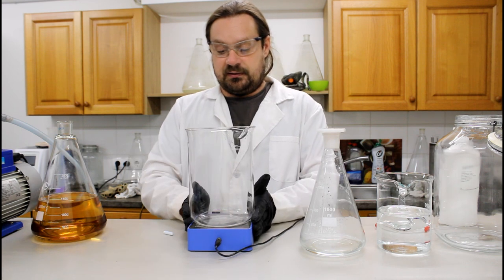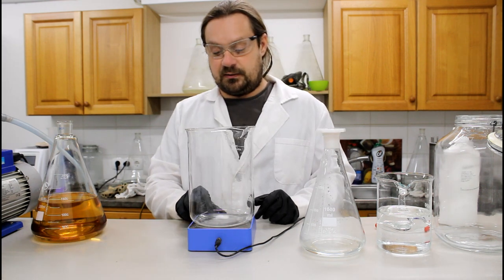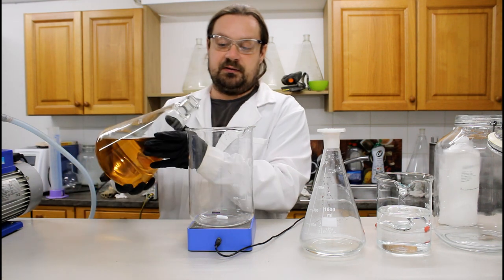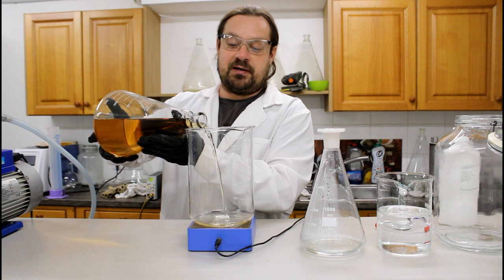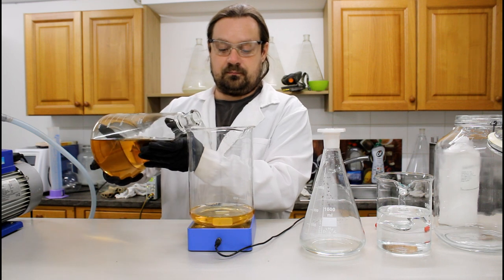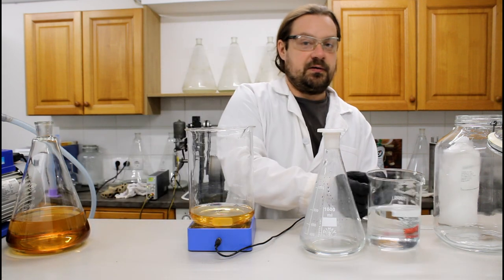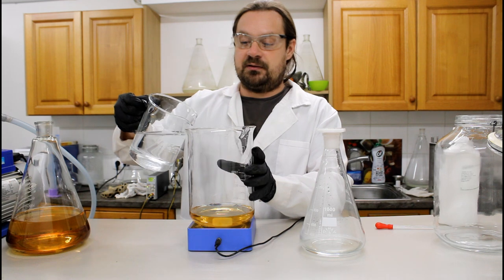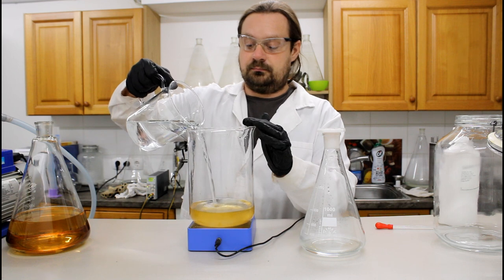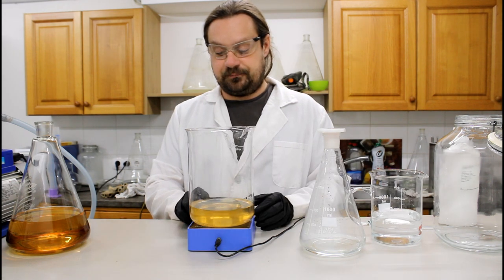So here we will do the precipitation. I just add a stirring bar. Okay, it works. So now we are adding a little bit of our high pH solution, not too much. Okay. Here we're having just plain normal water, and we will dilute the solution a little bit more. Give it a quick stir.